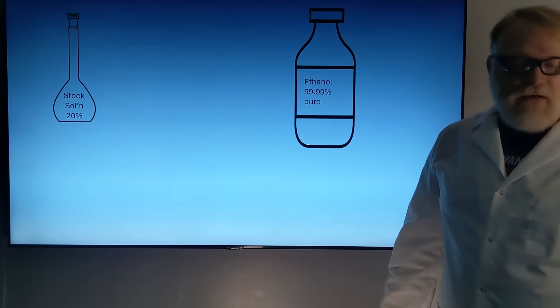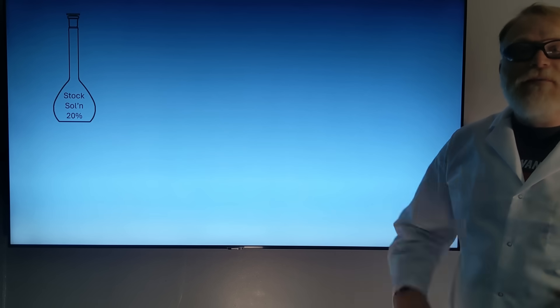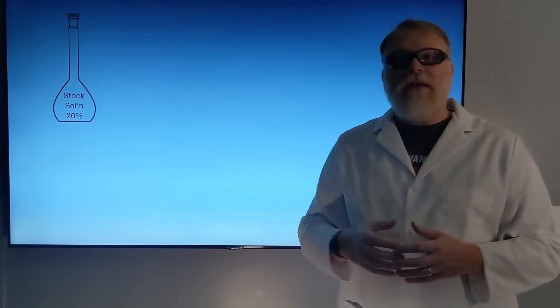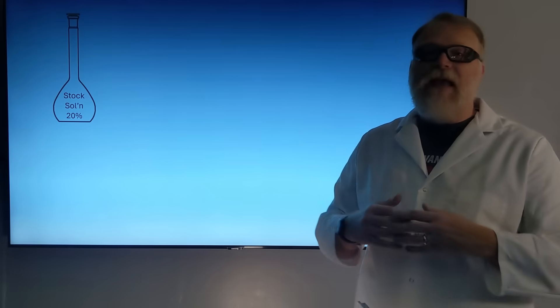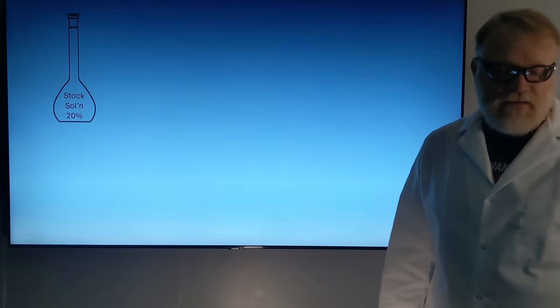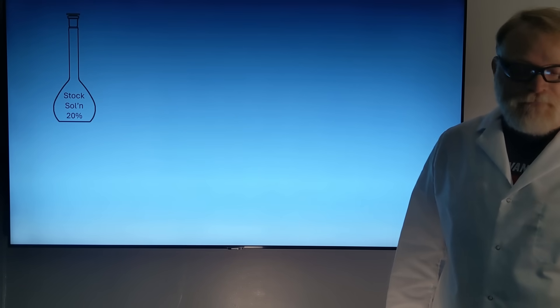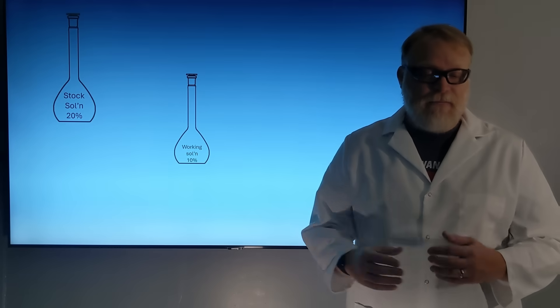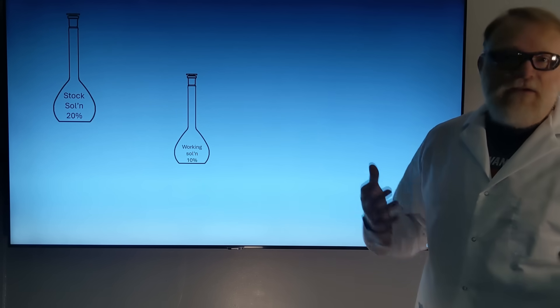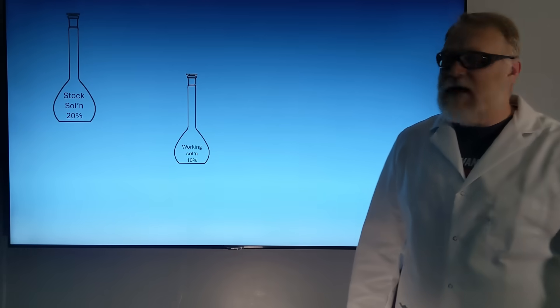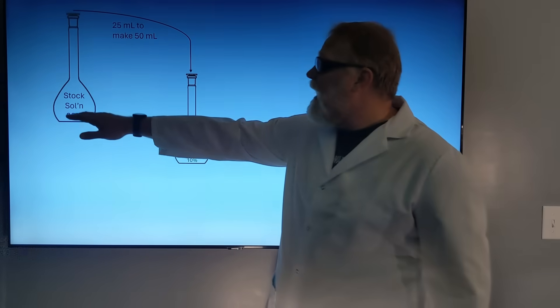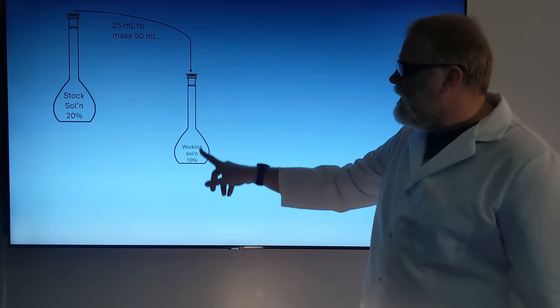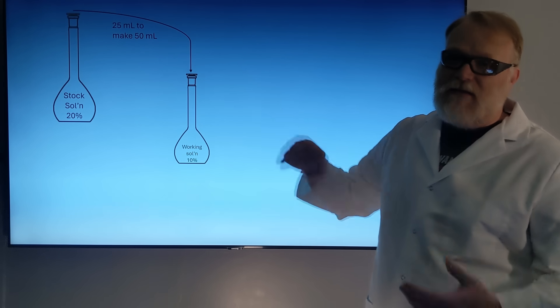Now we're working from our stock solution. We don't want to keep dipping into our pure substance, so we're going to make what's called a working solution — at 10%, just to make our dilutions a little bit easier. Using V1C1 equals V2C2 again, if I need to make 50 milliliters of my working solution, I'm going to take 25 milliliters of my stock, put it in the flask, and dilute to 50 milliliters to give me a 10% solution.